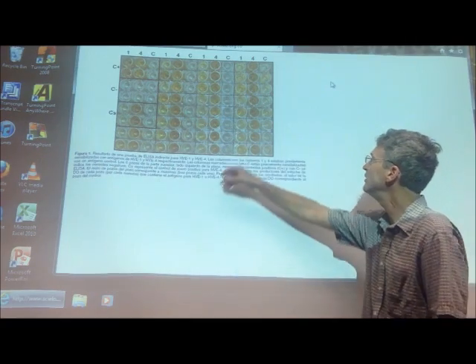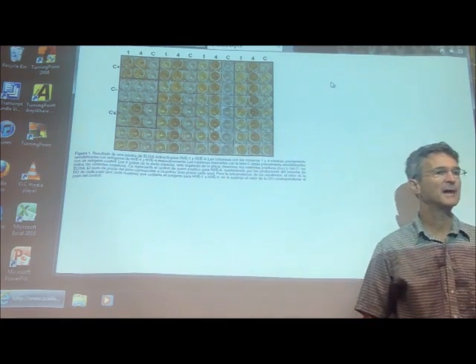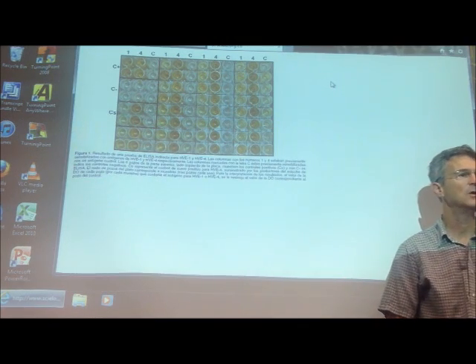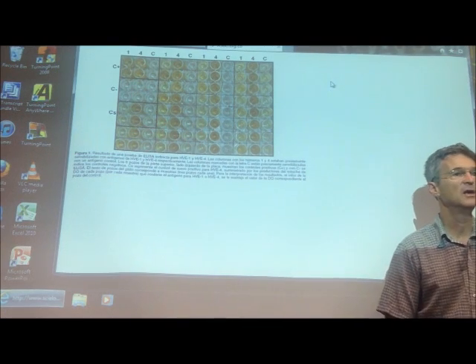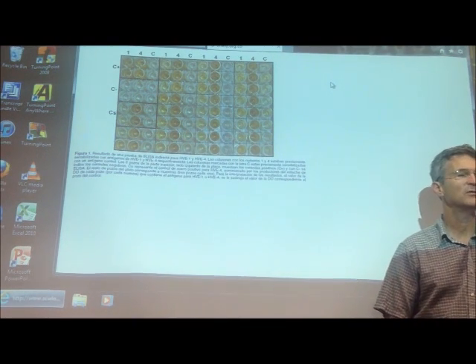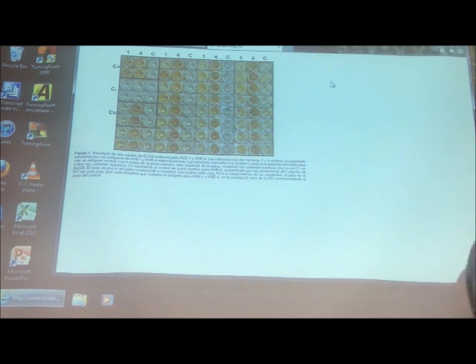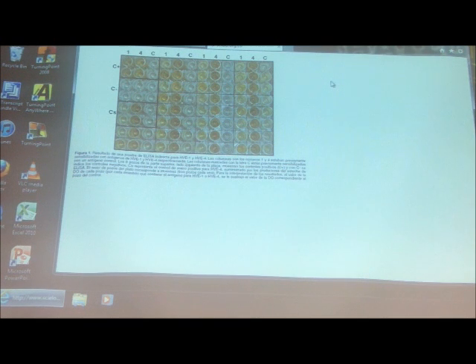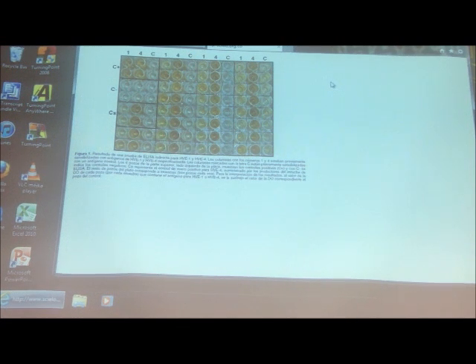And so maybe this over here might be the standard curve, and the machine will automatically read that, and it'll calculate for you how much you have in your actual test runs. And you can run dilutions of the test runs if you want to, but normally you just put all your test runs in there, and it's done automatically. Okay, so that's great. So basically, the darker the color, the more antigen we have.